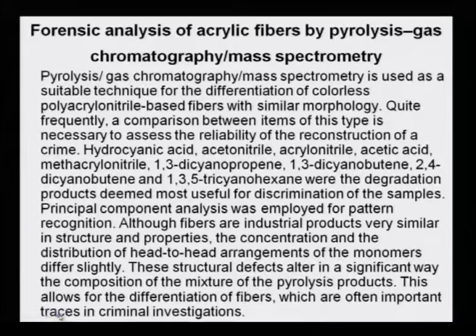There could be some alteration in the arrangement of different monomers, and that is what we get an idea of from the pyrolytic gas chromatography mass detector. These structural defects alter in a significant way the composition of the mixture of pyrolysis products. This allows for the differentiation of fibers, which are often important traces in criminal investigation.